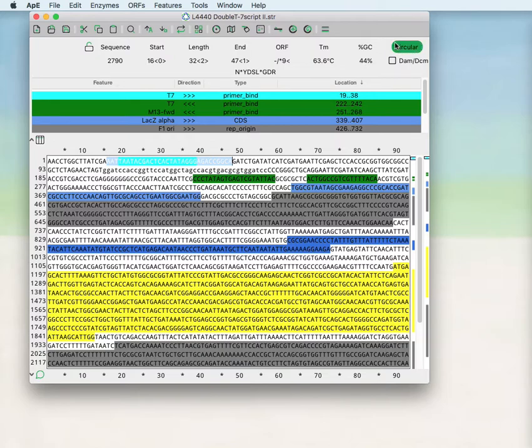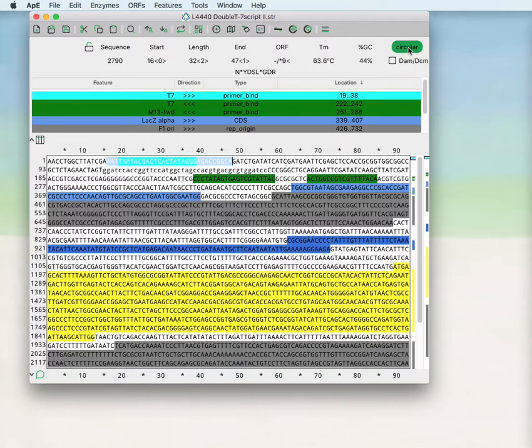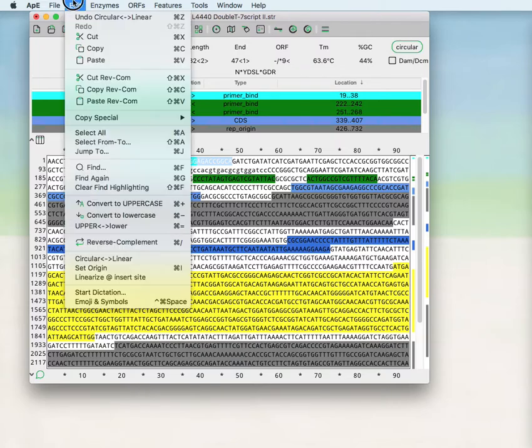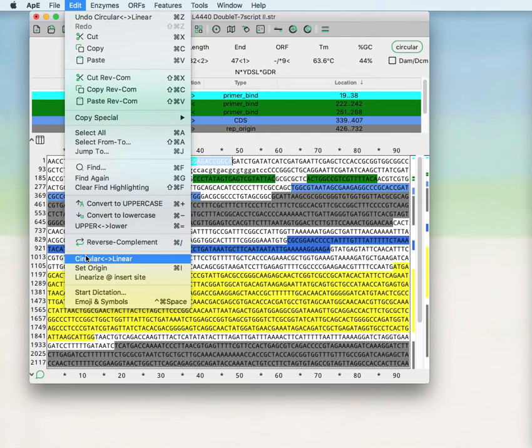Then this is information about whether the sequence is treated as circular or linear. You can change that by clicking here or in the edit box. You can change from circular to linear.